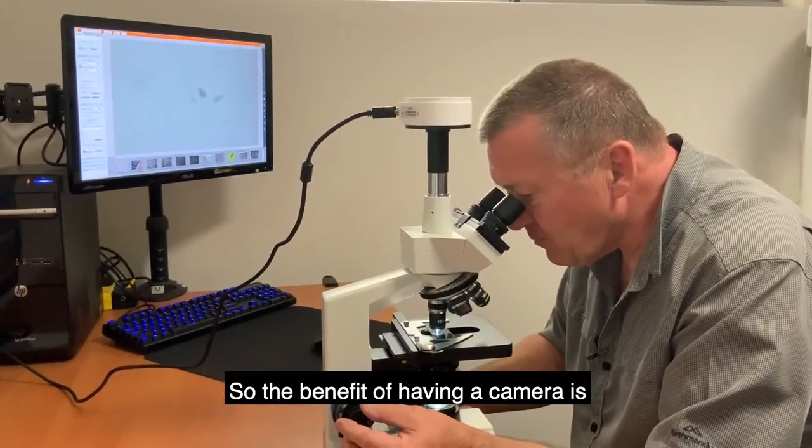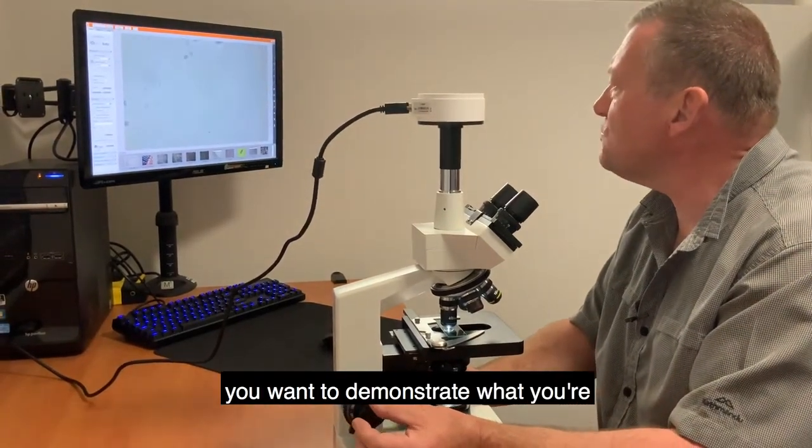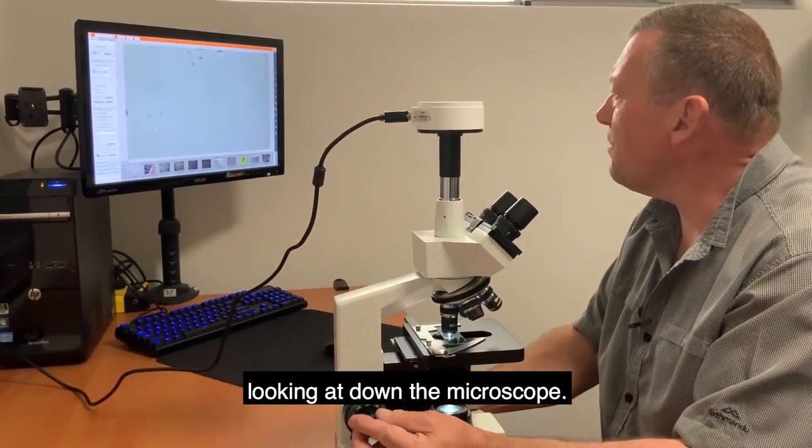The benefit of having a camera is that if you have other people around, you can demonstrate what you're looking at through the microscope on the screen, so everyone can see simultaneously.